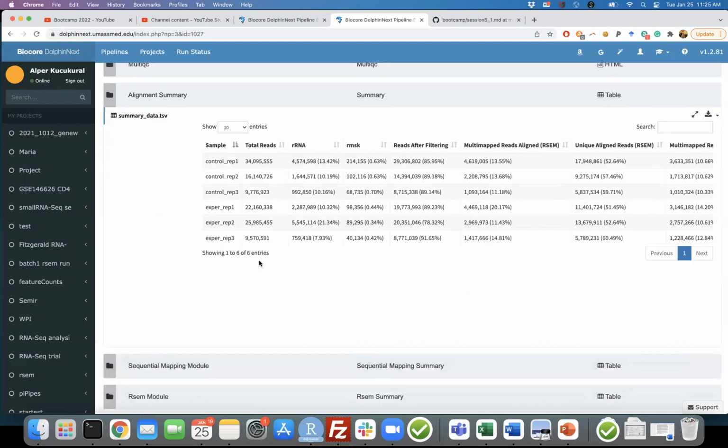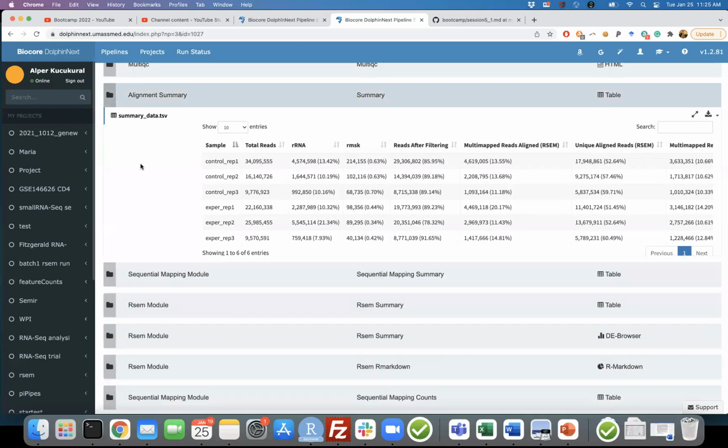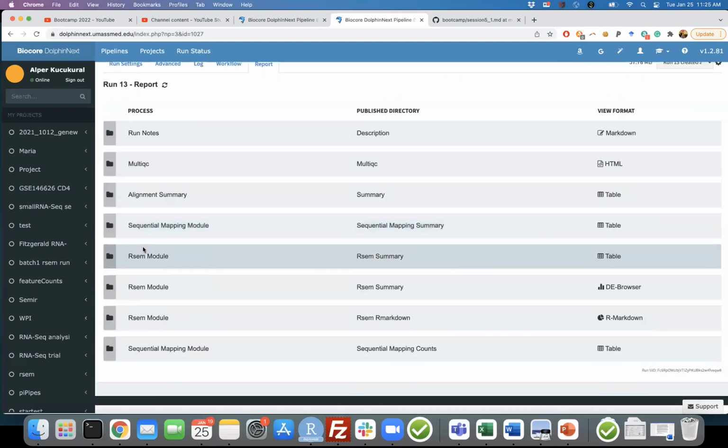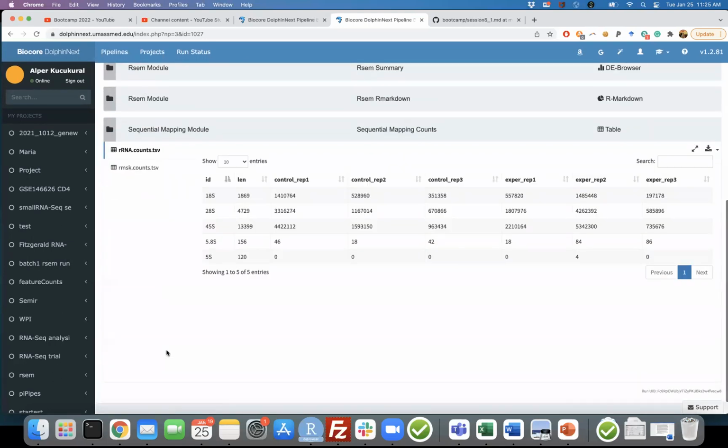So dprofiler, Arthur's tool, is the reason we created it: to detect these kinds of anomalies. It will tell you those things automatically and without any cherry picking. It will tell you, hopefully, which samples are not good to use for your analysis. It's not fully finished and integrated here, but hopefully it's going to be here and working. So the detailed modules you're going to have here are some detailed runs.